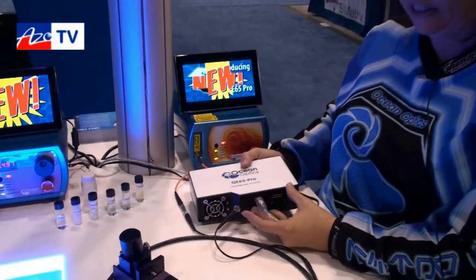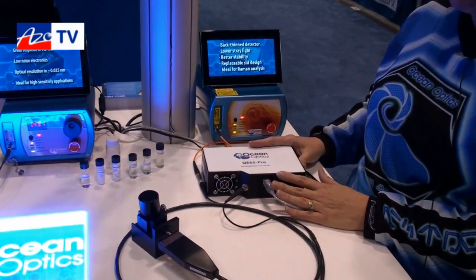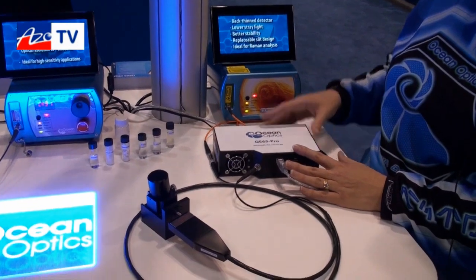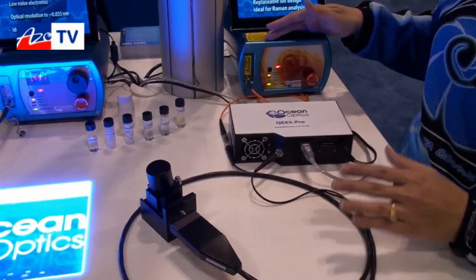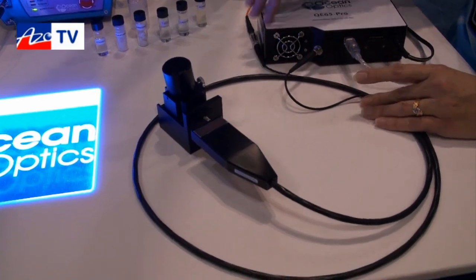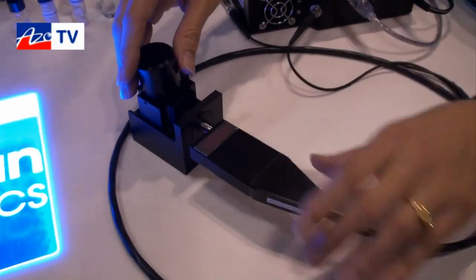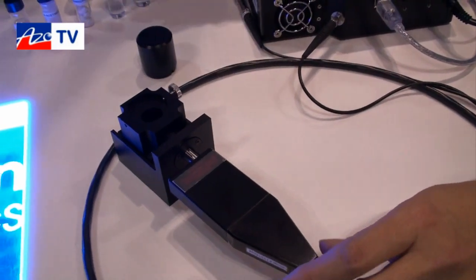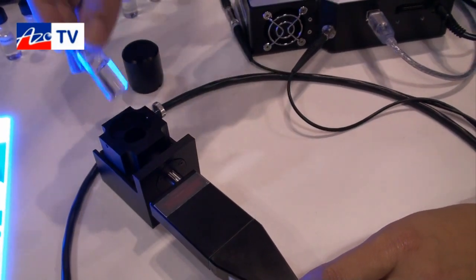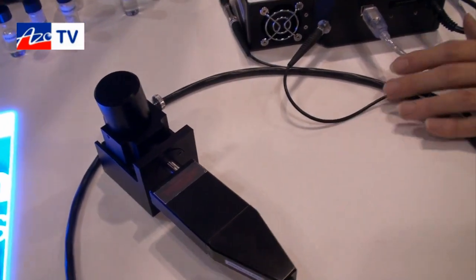The measurement we're making here is a Raman measurement — a 532 nanometer Raman measurement with the QE65 Pro. We have a laser and a probe coupled to the spectrometer with this fiber optic probe, and we're looking at a sample holder. Adding your samples, whether they be solids or liquids, is as easy as popping the sample in and taking your measurement.